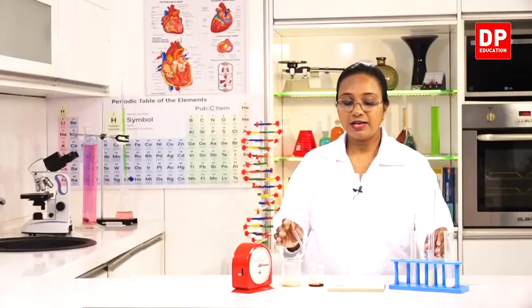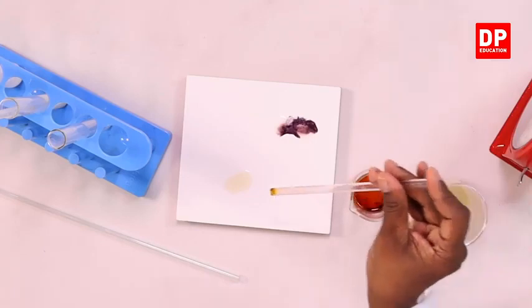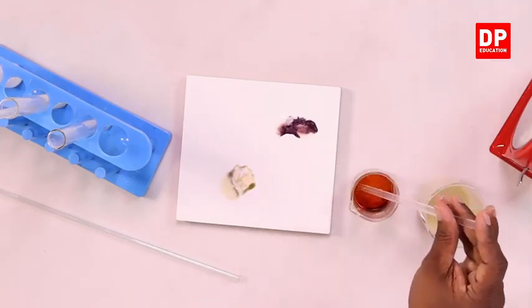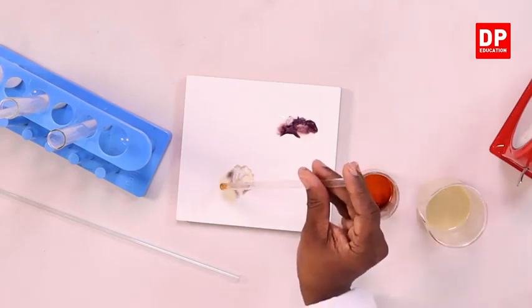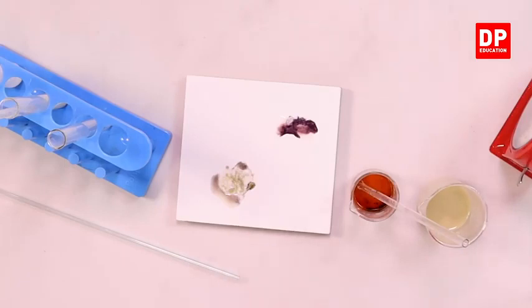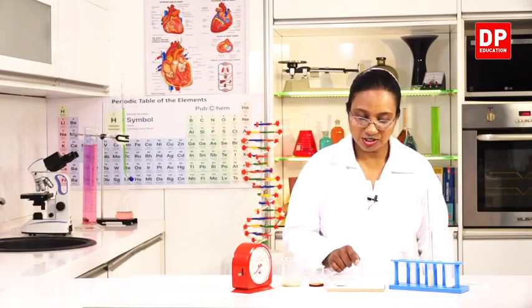To this, I will add a drop of iodine, and another drop to see the color change clearly. Here also you can see the formation of dark blue color, but compared to the starch solution, this is somewhat lighter. A slight difference can be observed.